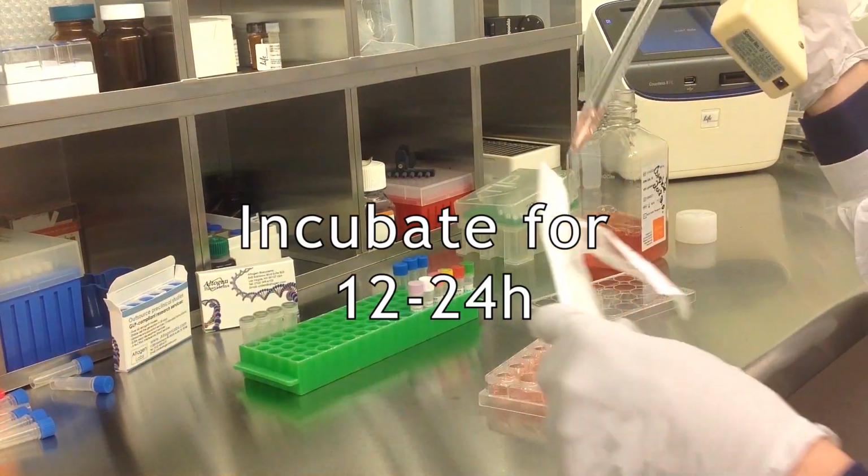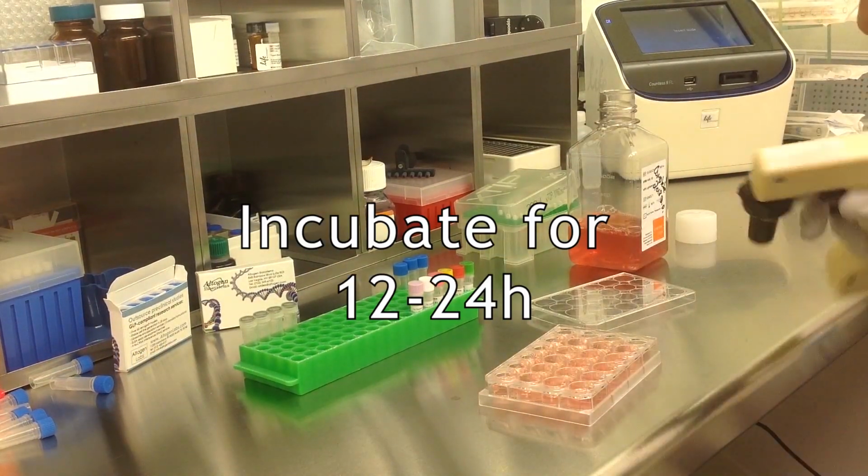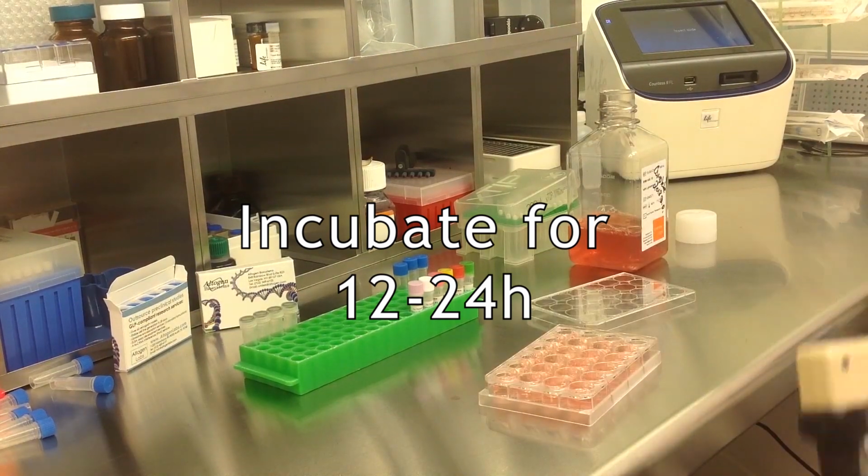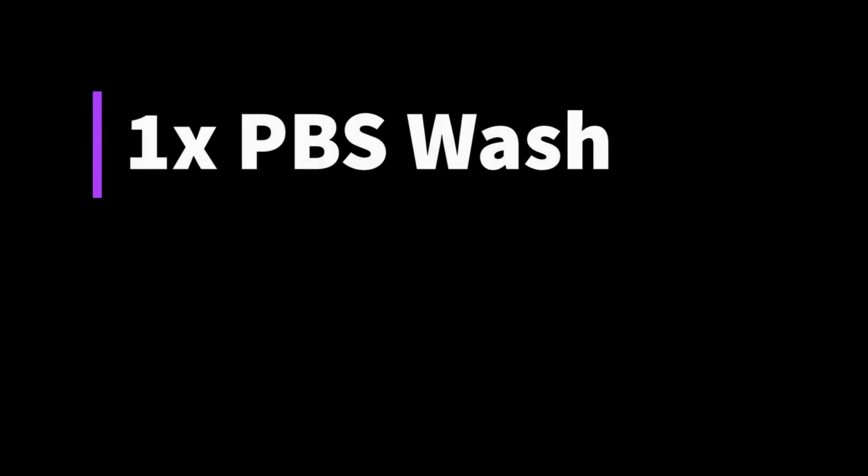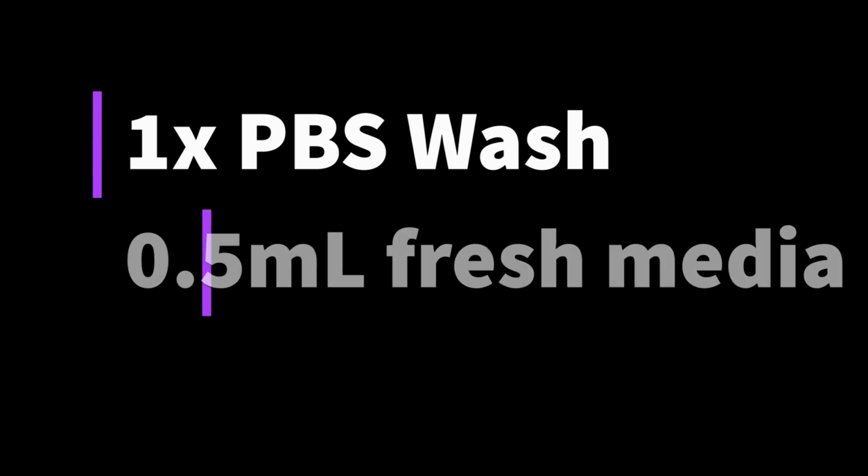Incubate the cells for 12 to 24 hours before transfection at 37 degrees Celsius in a humidified carbon dioxide incubator. When you are ready to transfect, aspirate the growth medium, wash the cells once with PBS, and add 500 microliters of fresh growth medium.